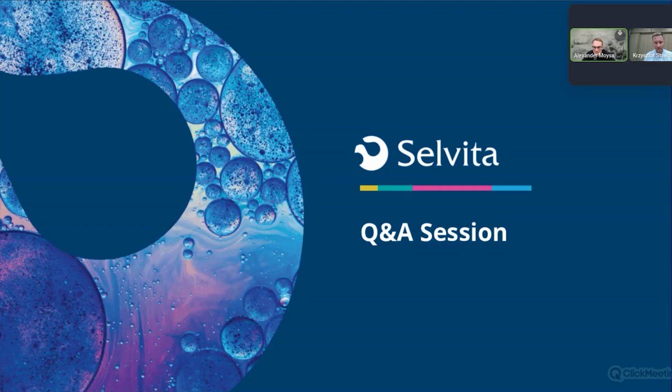Thank you. There is another question coming from Javier, and it's about normalization of results. How do you normalize the results between replicates, and how do you quantify proteins? Regarding quantification of proteins, there are different approaches.